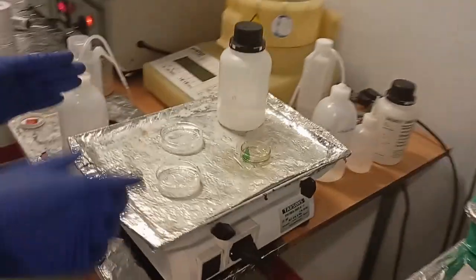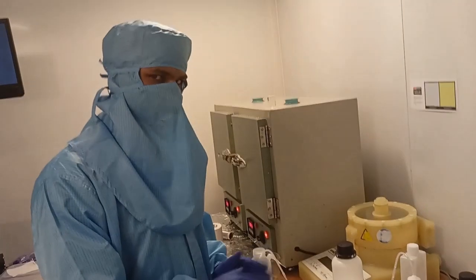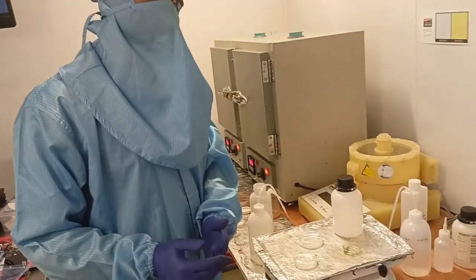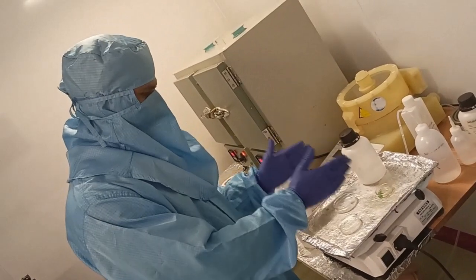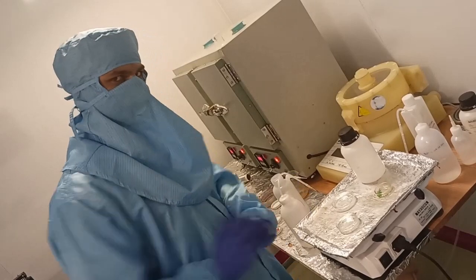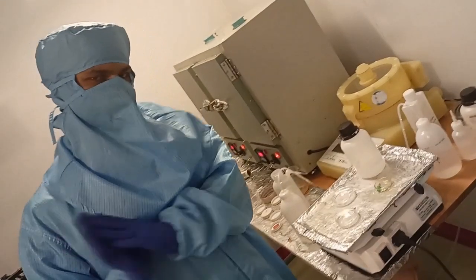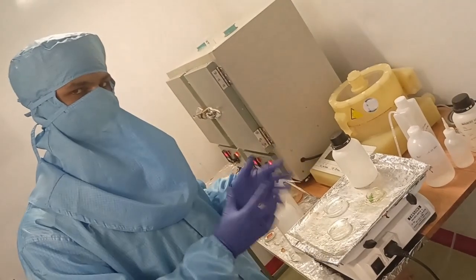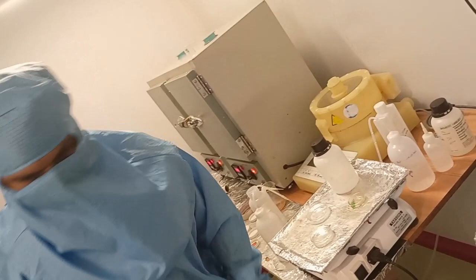The developer is a basic solution. It is actually 20% caustic soda, I mean KOH, and 80% DI water, deionized water. It is already mixed, I mixed it. It is a mechanical shaker, used to rinse off the photoresist, because the photoresist is an acid and this is an alkali solution. So it will react and rinse off the portion where it was exposed.